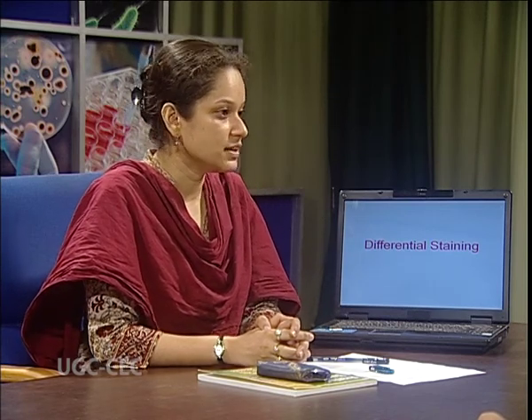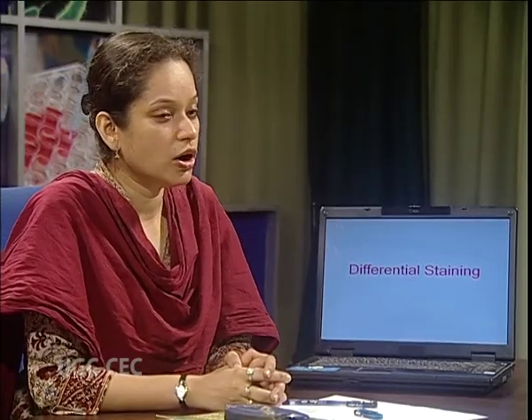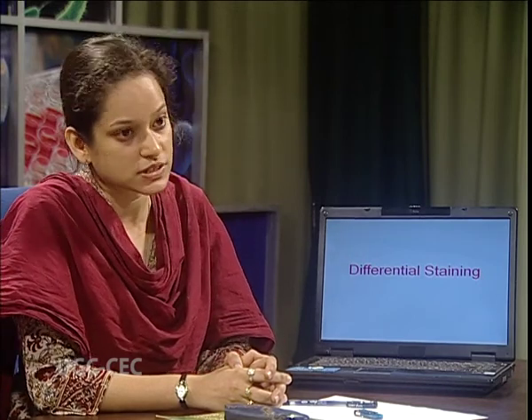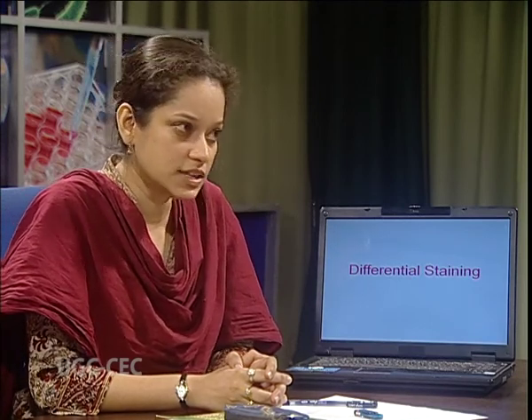If the primary stain is removed, then the cells become decolorized. As a result, we won't be able to see them under the microscope. So, in that case, we go for a counter stain which imparts color to the decolorized bacterial cells. So, in this way, on the basis of the chemical properties of the bacterial cell, we choose what kind of stains we want to use. Accordingly, the function of differential staining can be divided into two main parts.